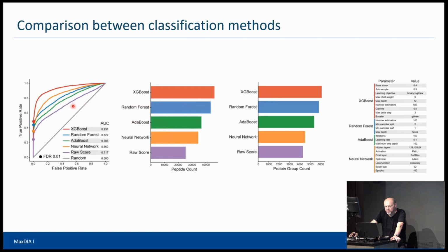One is just to make ROC curves of these decisions, basically. So made in cross-validation, and then you make ROC curves, which you probably have seen. And for ROC curves, you always want the curve to go vertically up to 1 and then horizontally to the corner. That would be the perfect ROC curve. And then the area under the curve, or AUC, would be 1 for this ROC curve. And so you want to get as close as possible to this. And if you have a classifier that shows a straight line from here to there, so AUC 0.5, this is kind of random prediction, right? If you had a random predictor, then you would get a straight line.